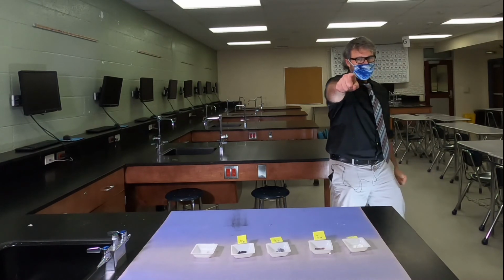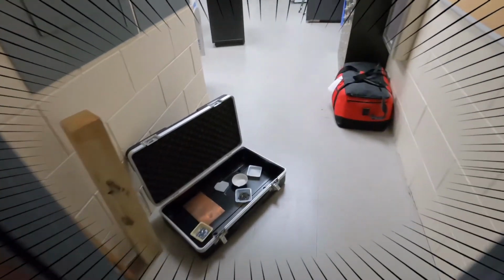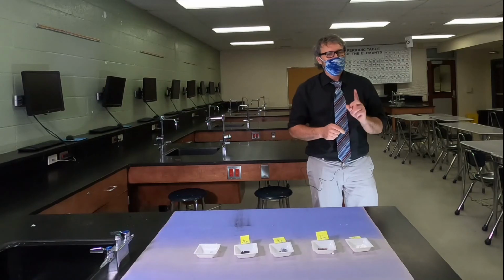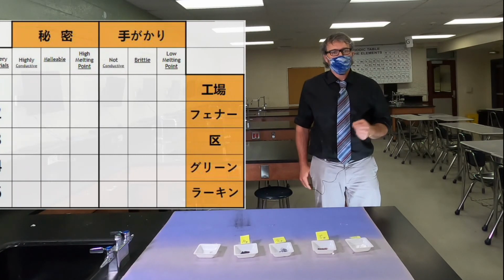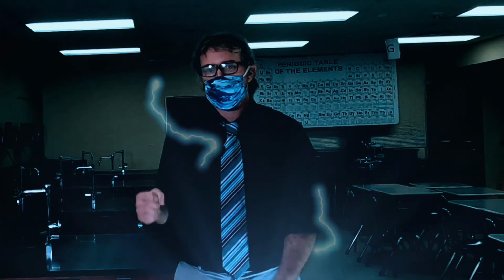Welcome to Northeast High School Science Department. Today, our super scientist team is going to take on a special challenge. Found in a dusty box deep in the chemical storage closet were these unmarked elements and compounds. We will conduct experiments on each of these items and gather data about their physical properties. Then, we will add those physical properties to this data table, and once we get enough answers, we can identify the unknown element. Then we will use this power to discover the secrets of these mysterious items.